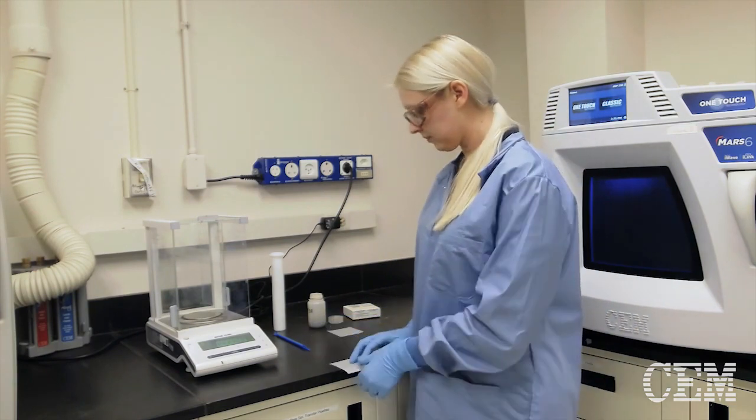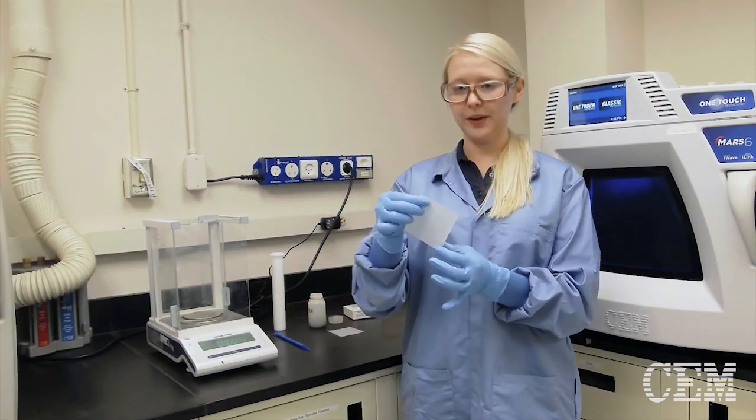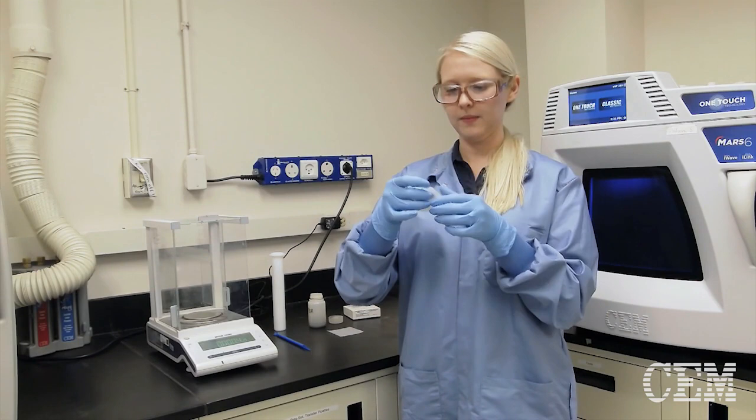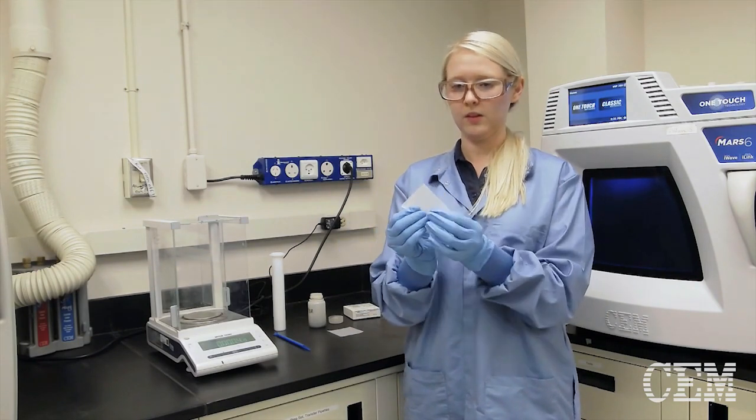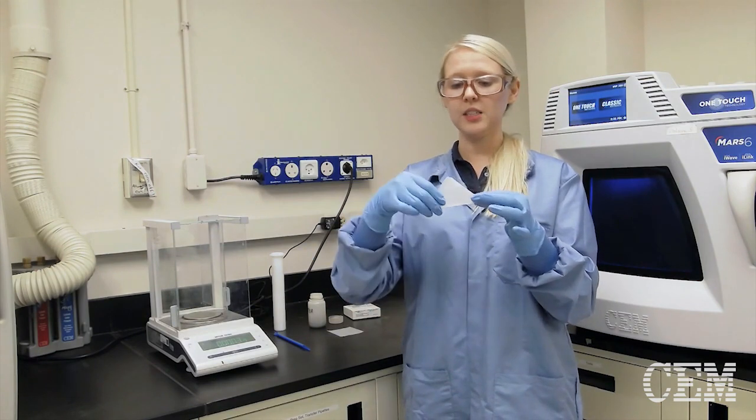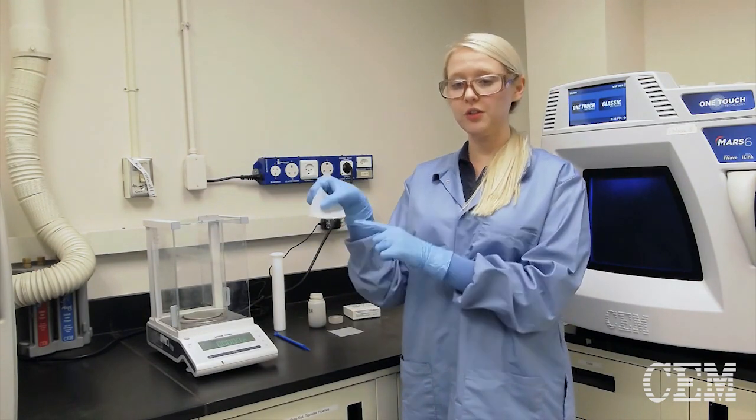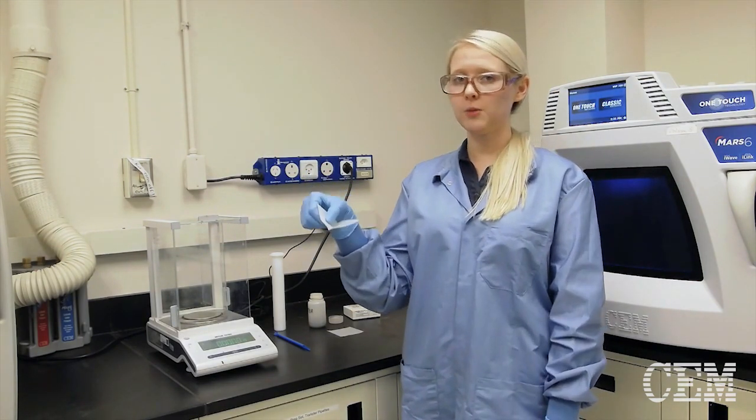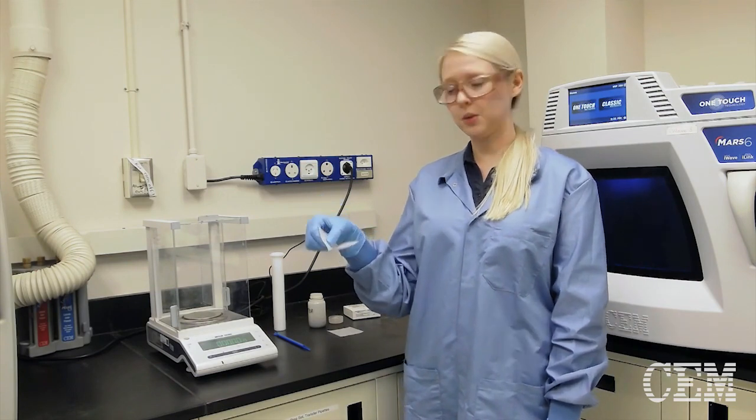First, I'm going to take a weigh paper and fold it in half this way. So it gives me a triangle shape. This makes it easier to weigh onto the sample, but pick it up to make it easier to transfer to my vessel.